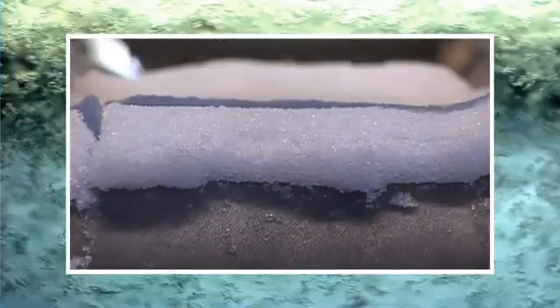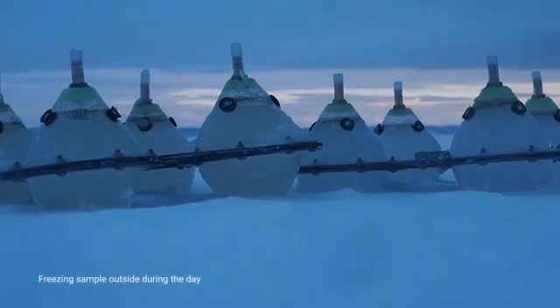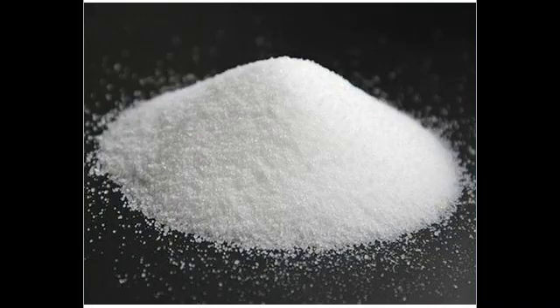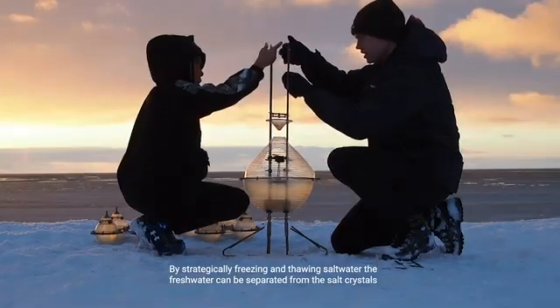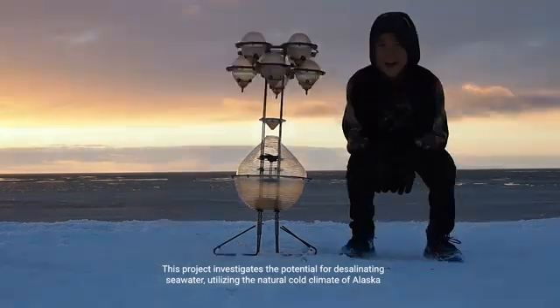4. Cooling crystallization, which is also a comparable conventional technique, is limited by the remaining solubility at low temperature, whereas EFC would in principle be able to achieve a 100% separation of the solution into ice and salt if no purge streams are needed. The aim of this work is to experimentally validate the simultaneous formation of ice and salt crystals as two distinct separate solid phases in an indirectly cooled continuous suspension crystallizer. The model systems are copper sulfate pentahydrate ice and ammonium dihydrogen phosphate ice.